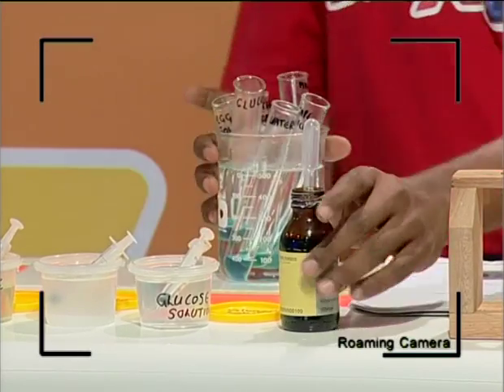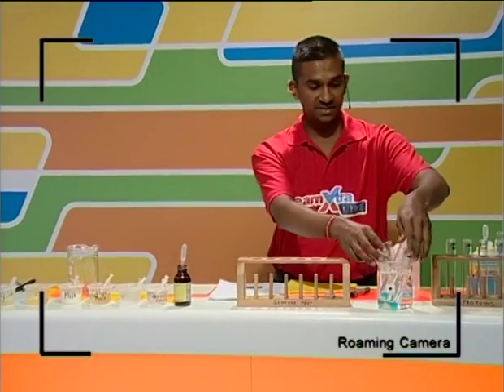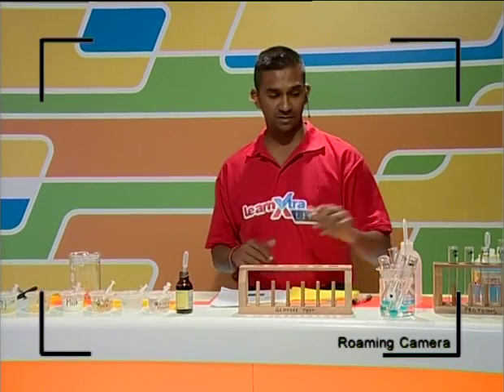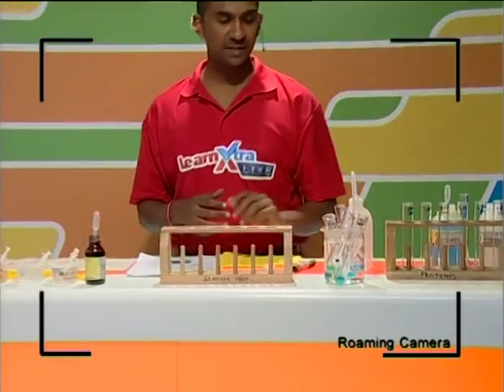So here you see them right in the front here, guys, and you're going to watch out for color changes. And obviously, because these have been mixed up and not in a test tube, you're not going to know. But it's going to be interesting after a little while, probably about 5 minutes, when we see some color change. And if you look carefully, guys, we're seeing some color change already. Let's not interpret those results now.